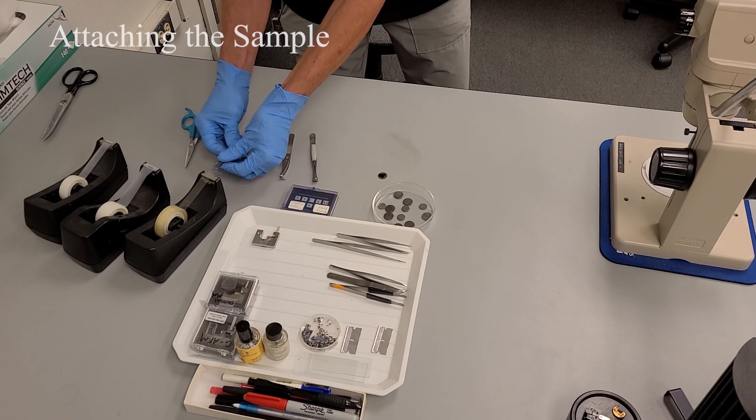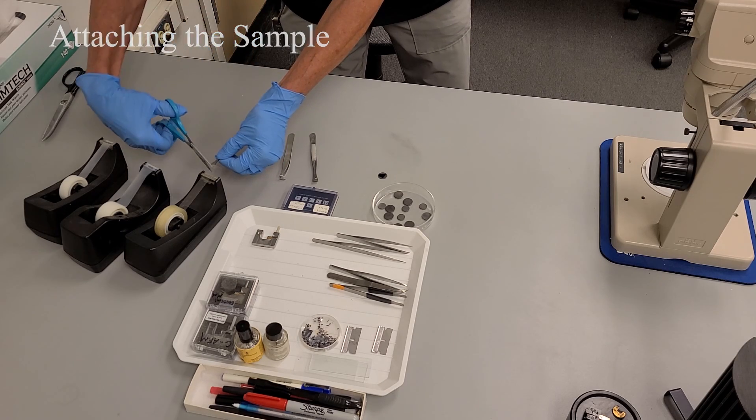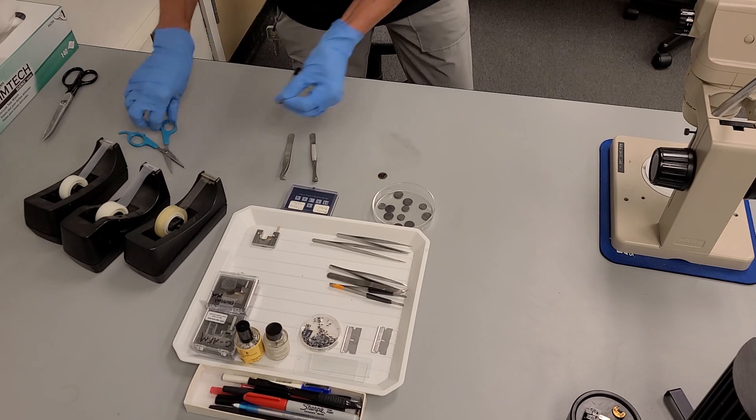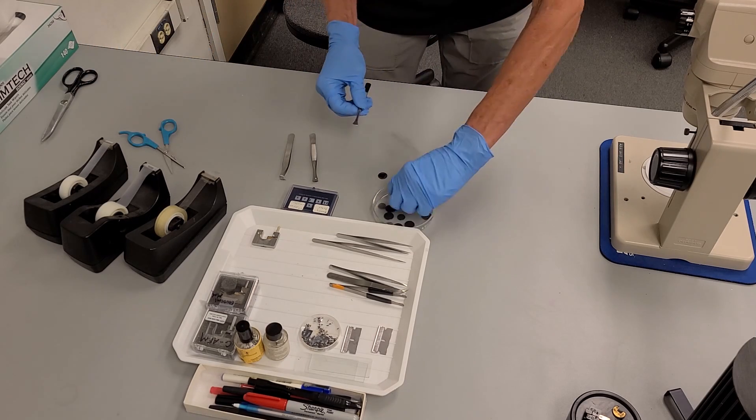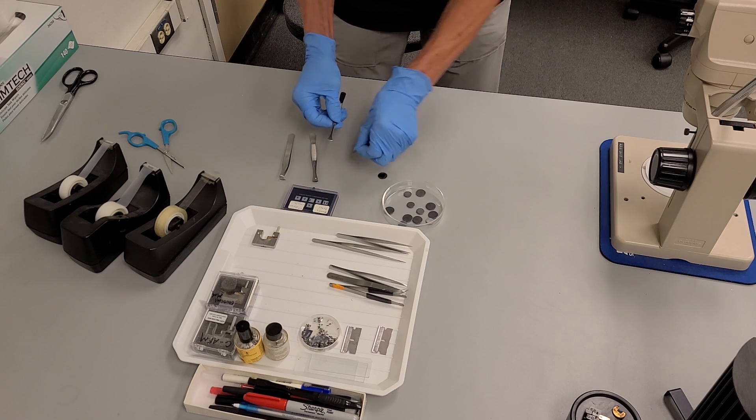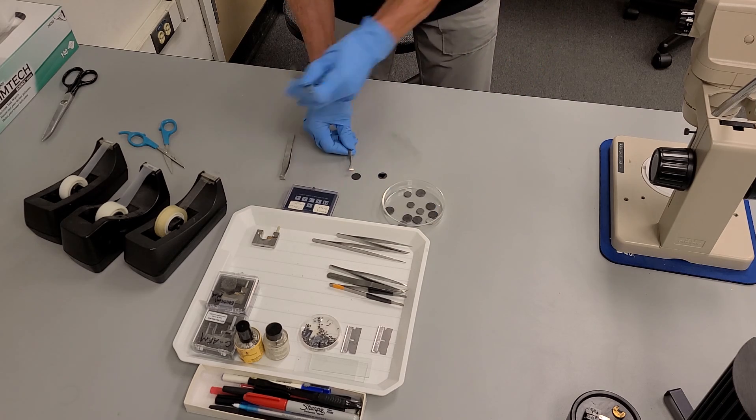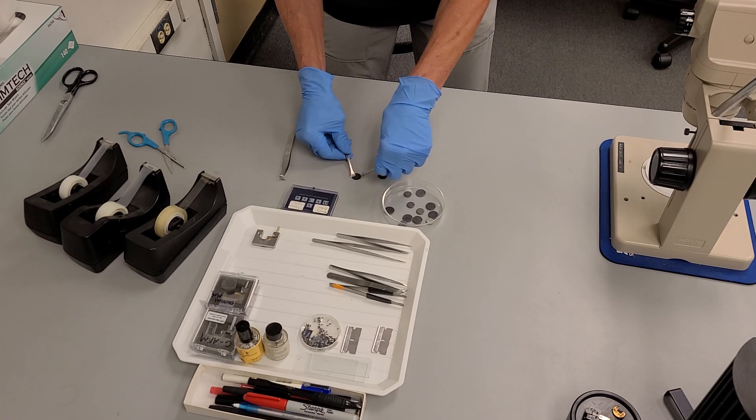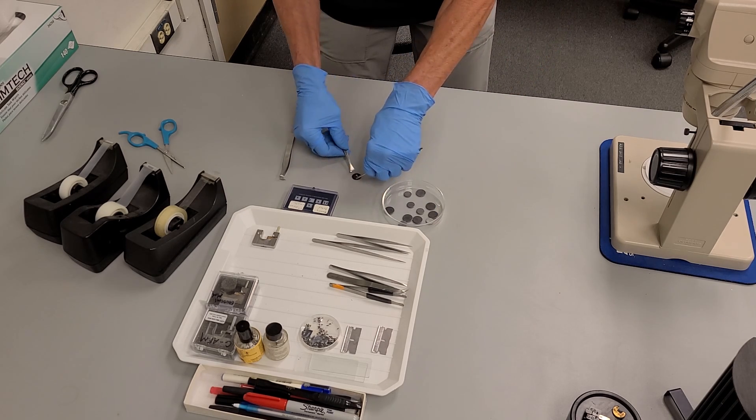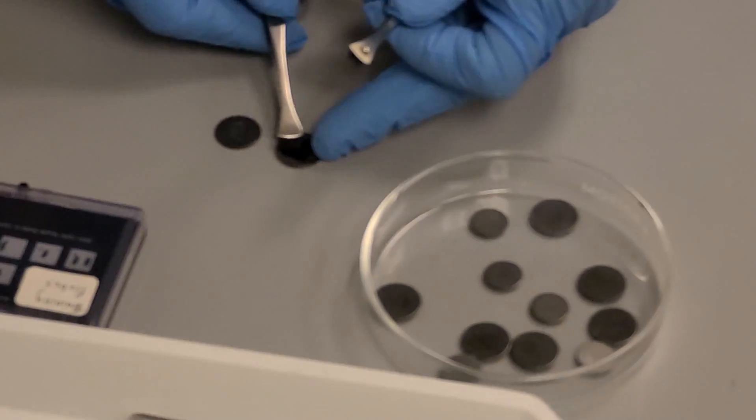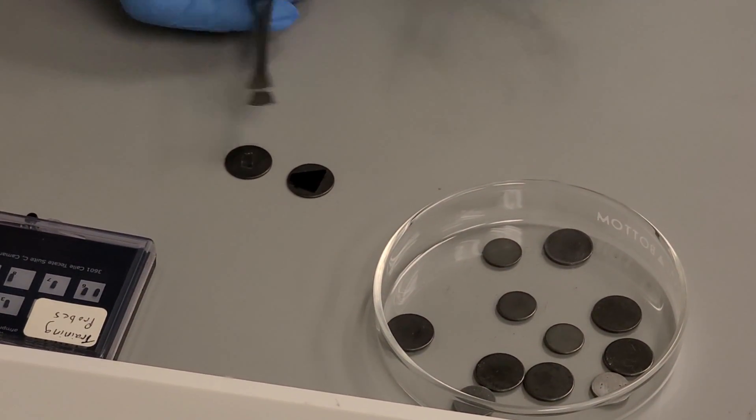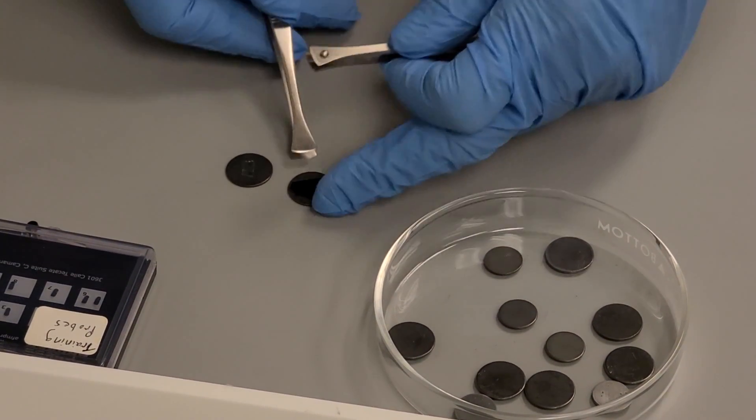Using tweezers, advance and cut a small piece of double-sided tape from the dispenser. Attach it to the center of the disc, making certain the tape is flat and wrinkle-free. Place your sample onto the tape, making certain it fits within the diameter of the disc and is level.